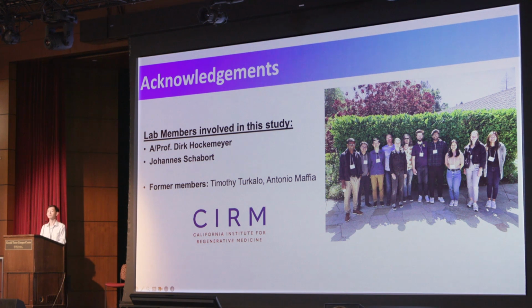Thanks. I actually have a very general question here. Have you looked at the combination where the cells are telomerase positive and ATRX negative? Do they have super long telomeres, or which mechanism takes over, the ALT or the normal one?